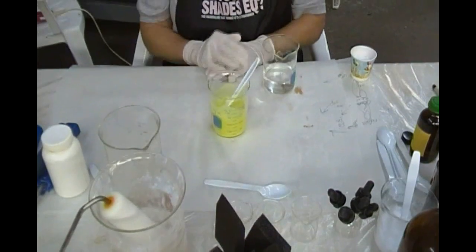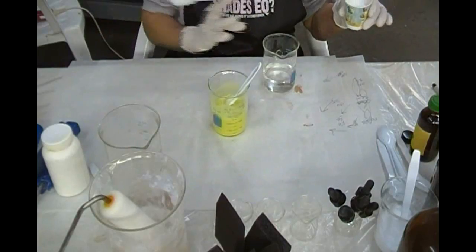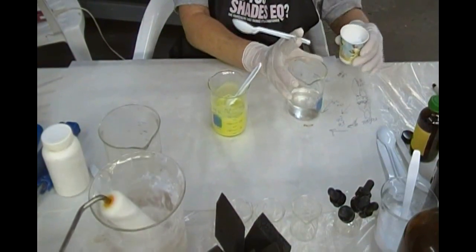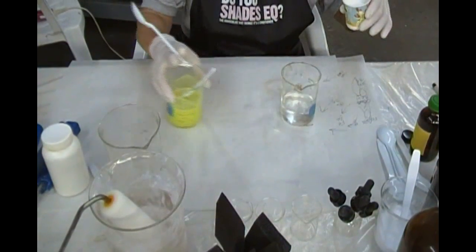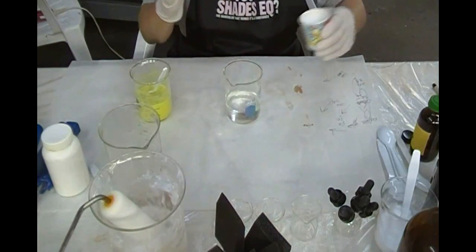Now Maddie can add the guanidine carbonate to 100 milliliters of water. It is 36 grams of guanidine carbonate. This will not give us the bubbles yet.